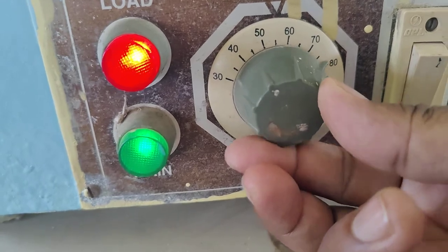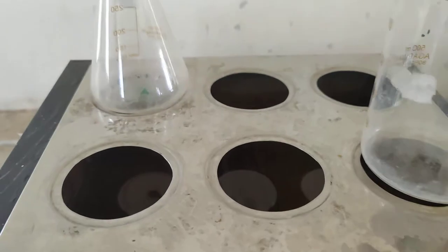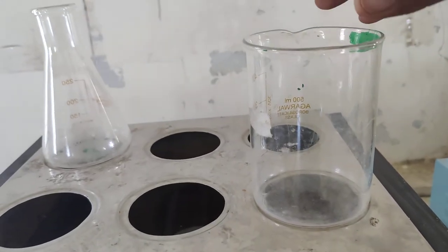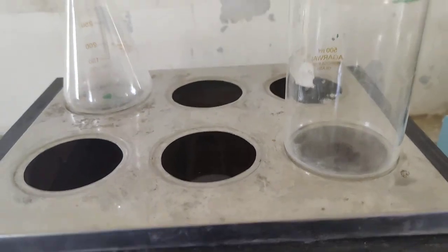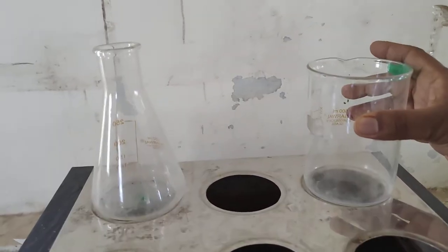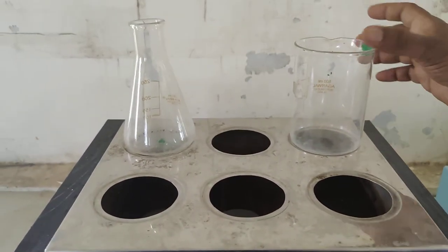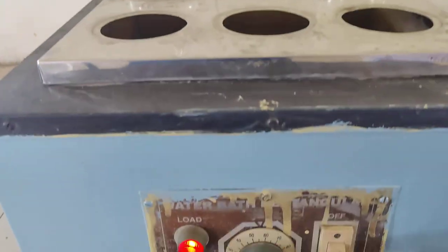The temperature can be adjusted from a minimum of 30 degrees Celsius up to 110 degrees Celsius using this knob. After switching on the instrument, I have set it to 100 degrees Celsius because I want steam to warm my content. Just place the beaker here with the content you want to warm. Once the water boils, the steam will rise from the surface and warm the content in your beaker or conical flask. Thank you.